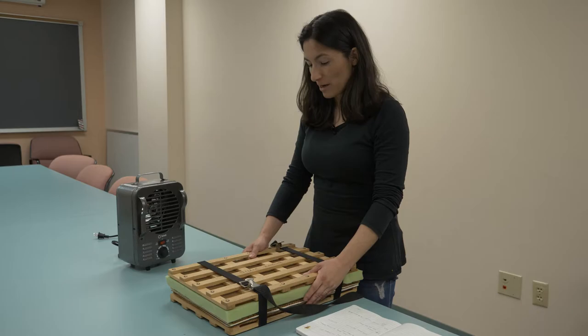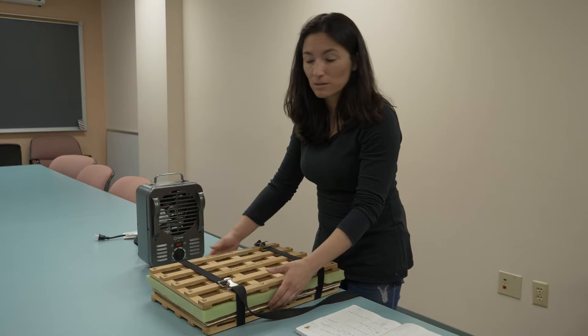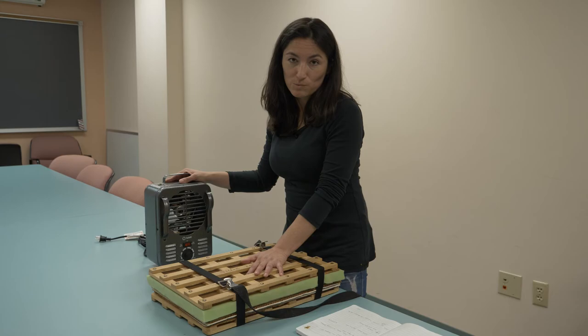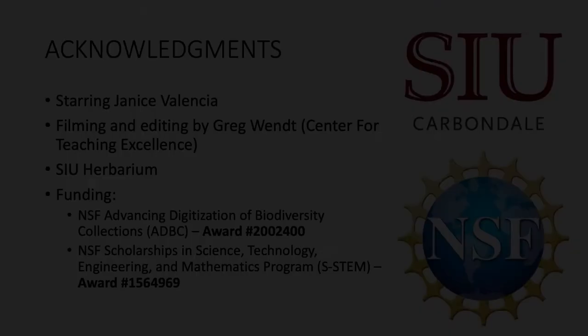Now that your press is assembled, you want to put it to dry. You need a dryer that you place in a safe area. Your dryer is just going to move air through the corrugates, and in that way dry all the material. Have to be very careful to set it in a secure area — so don't burn your house! In the next tutorial, we're going to learn how to make labels for these specimens. You can make them in the meantime while these are drying, and we're going to use the information we collected in our notebook. See you there.